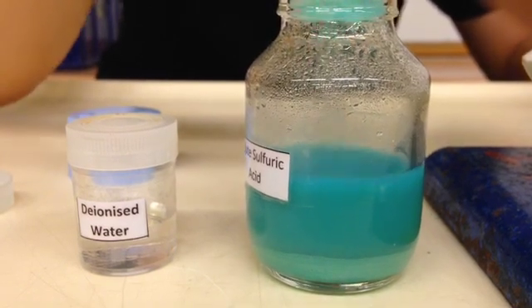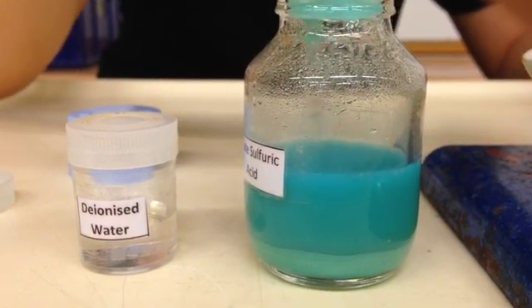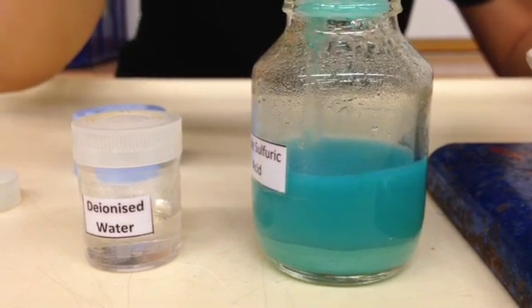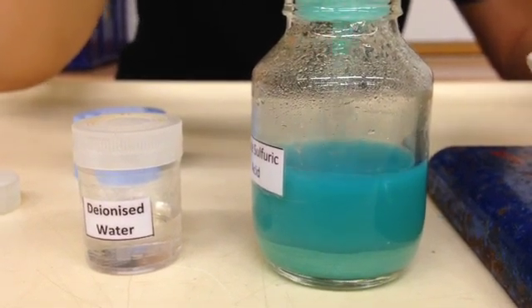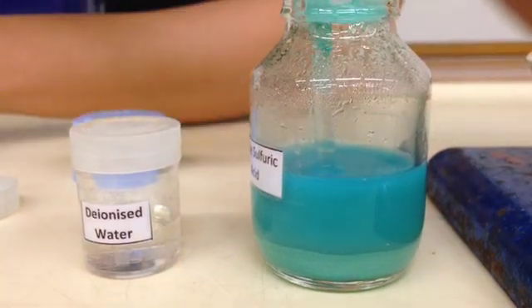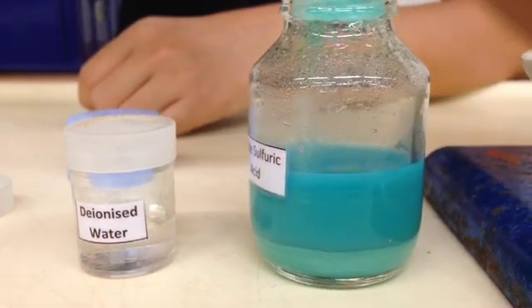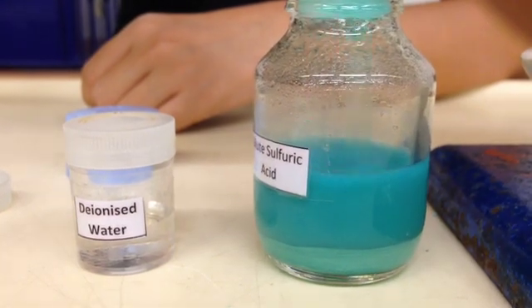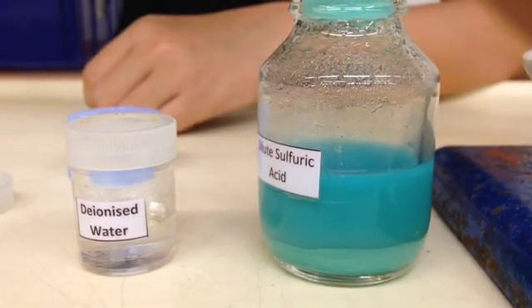So you can see that actually effervescence has more or less stopped already, so this actually indicates that we are reaching the end point of the reaction and you can see that there's quite a lot of green color powder left at the bottom, so this shows that there is indeed excess copper 2 carbonate which is the insoluble reactant and all the acid has actually been reacted away.